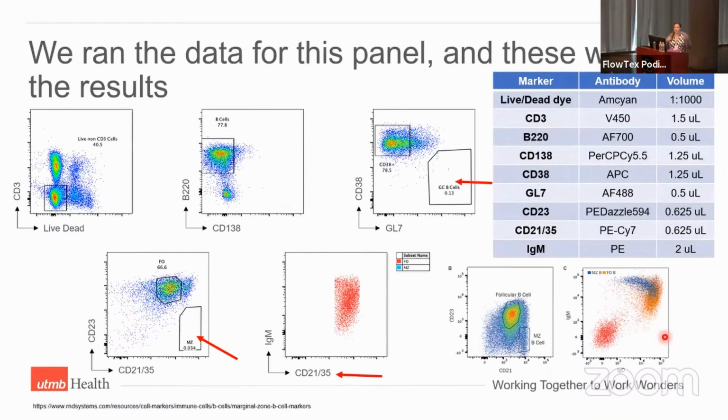Again, this was a vaccinated infected mouse. There should have been germinal center B cells. So great, they just spent all this time. It was about 6 months of an infection, so probably around a $20,000 experiment in the vivarium, and they got little to no information because they didn't spend a few minutes talking to us.